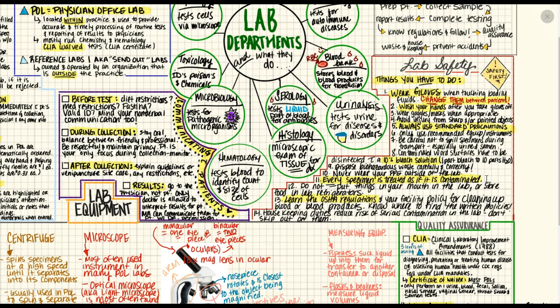But, you know, you don't want to put things in your mouth that have been stored in lab refrigerators because there are gross things in lab refrigerators. So, that's gross. Also, there's a rule not to apply cosmetics like lipstick or makeup or eye makeup or anything inside of a lab because things are floating around in the air that could contaminate you anytime you put them anywhere near a mucous membrane.